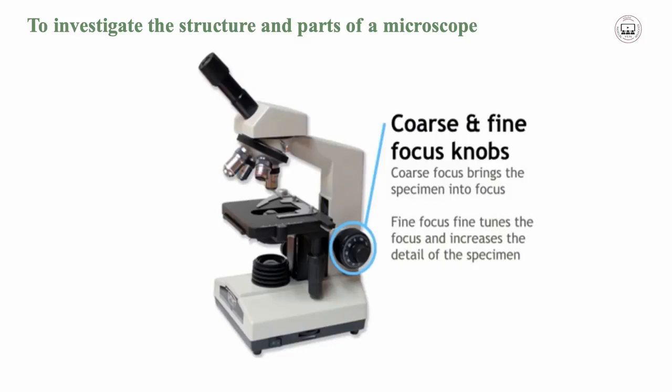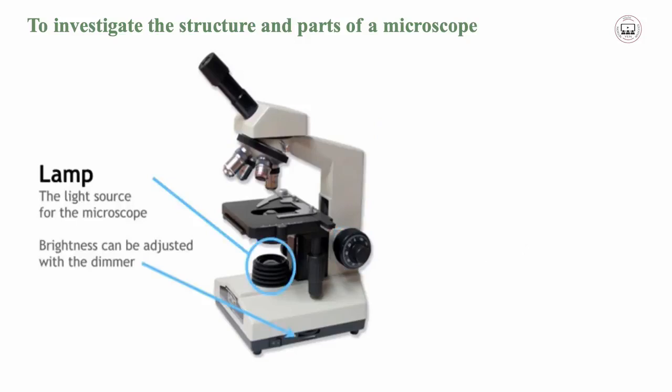The fine focus fine-tunes and increases the detail of the specimen. The lamp. This is the light source for the microscope. The lamp brightness can be adjusted using the dimmer.